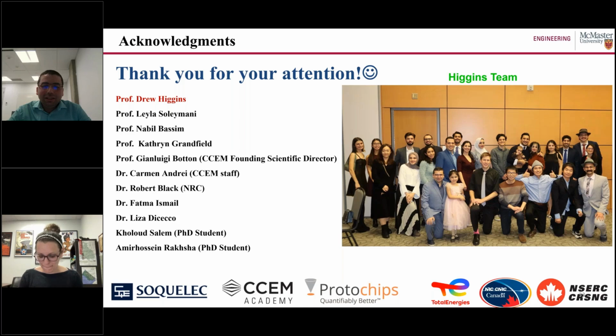Yeah, so it depends. For example, under carbon dioxide reduction, as a byproduct, we introduce some bubbles. But for other applications, you can just apply a very negative potential for a very short time, like 2 seconds. You can just apply, for example, -2 V versus platinum, just 2 seconds, so you can create very fast bubble formation. After that, you can get your analysis. But in the case of carbon dioxide reduction, as a byproduct, you already have bubbles around your working electrode, so you just take advantage of what you're already generating.